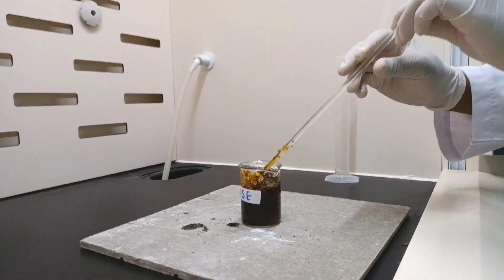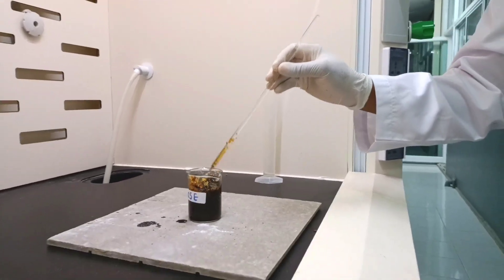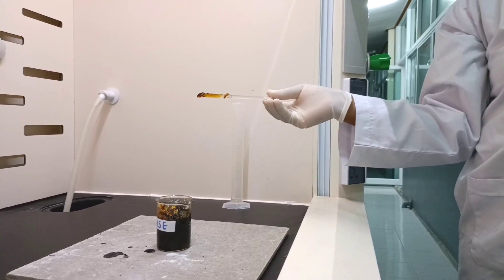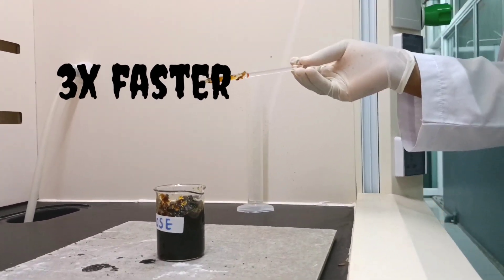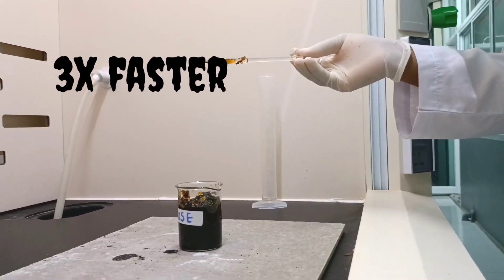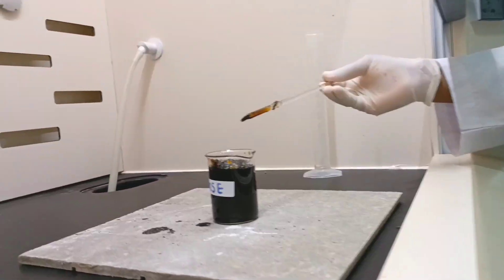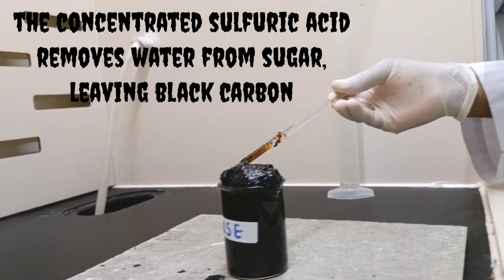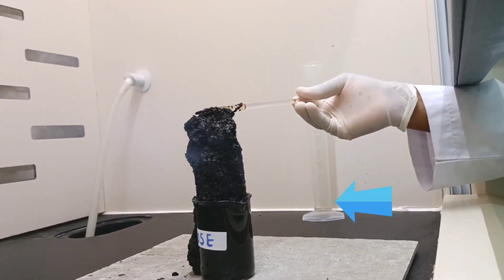Now we have our sucrose all stirred and we watch what happens. Can you see? It has turned completely black — my carbon snake! Wow, look at that!